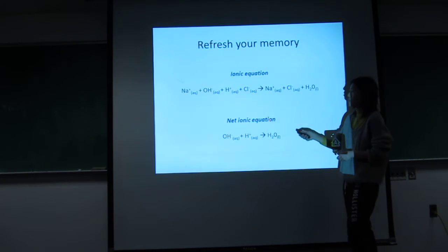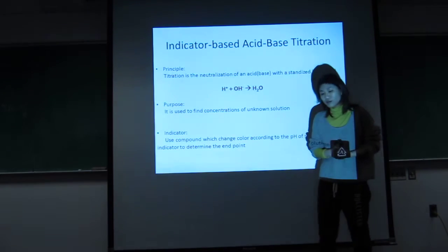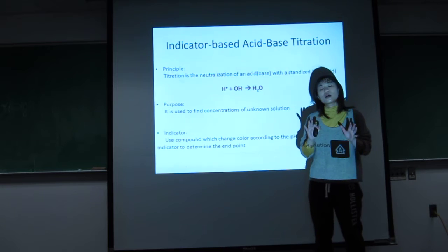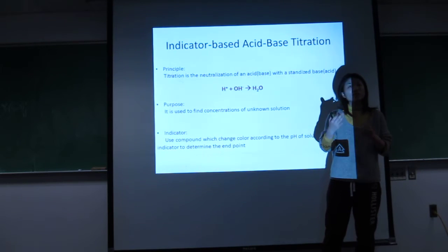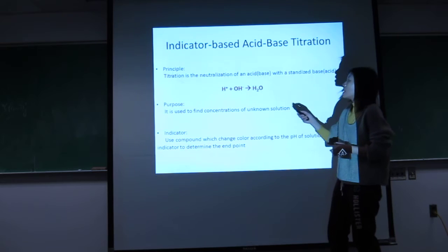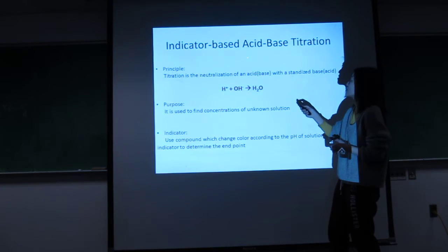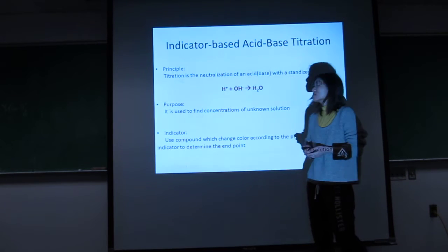So please remember this. So the next thing, the most important part that you are going to do for the experiment next week is the indicator-based acid-base titration. So what is that?